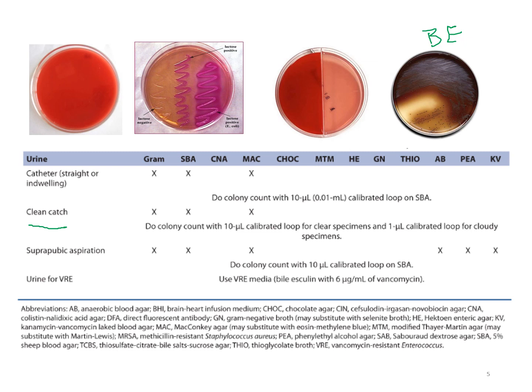Now, some labs will actually use a split plate for their urine, so you've got the blood agar on one side and the MacConkey on the other side. This could be the case if you have laboratories with satellite sites, where they'll go ahead and streak that urine plate, set it up, and then send it to the larger hospital lab to actually do the workup.